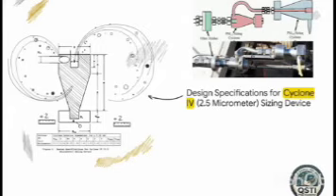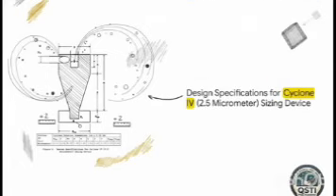We're talking about physical interior dimensions. The inlet diameter, the cup height, the cone angles, they have to be machined to within a tolerance of plus or minus 0.02 centimeters. That's incredibly tight. The air enters the cyclone, it starts spinning, and physical centrifugal forces just drop the larger particles into the collection cup at the bottom, while the smaller PM2.5 particles are carried right up through the top and catch onto the filter. This precise physical separation is exactly why your flow rate has to stay absolutely constant.